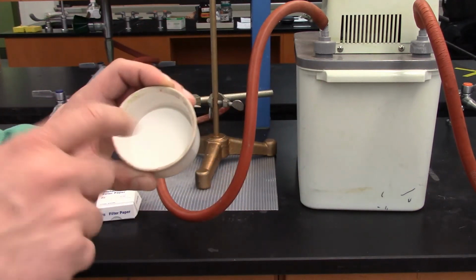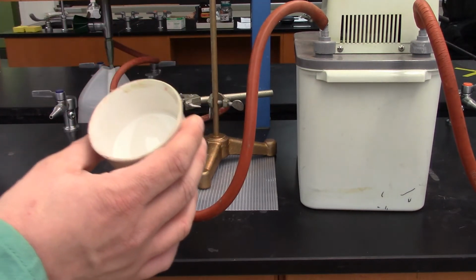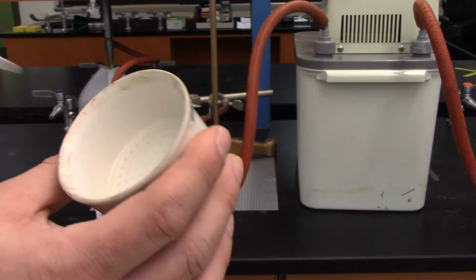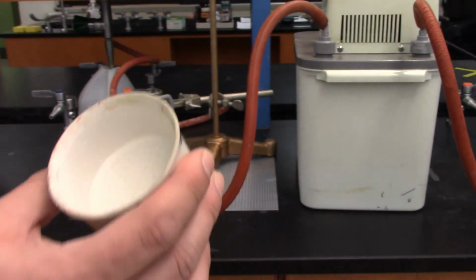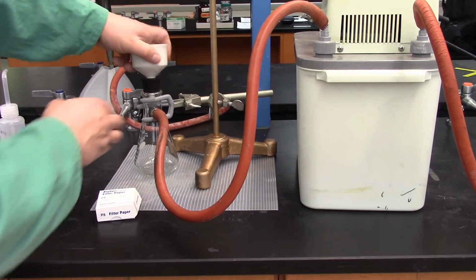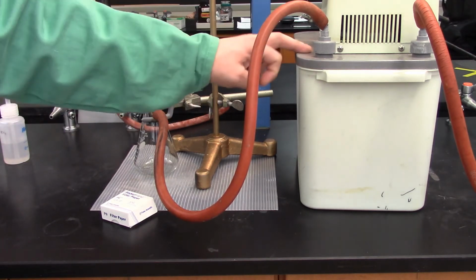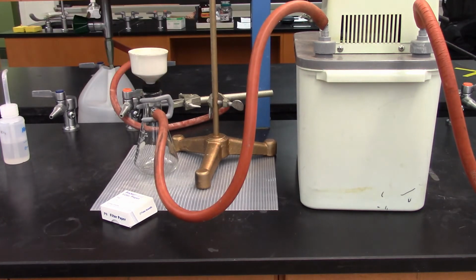As you remember from last semester, it's always important to wet the filter paper, especially around the sides, so we create a nice seal which will prevent any of our solid from slipping underneath and then dripping into the sidearm flask, right? So I have this here, filter paper's in, check, and then we got our whole setup done here. This is if you're using the vacuum aspirator, which we'll plug in.